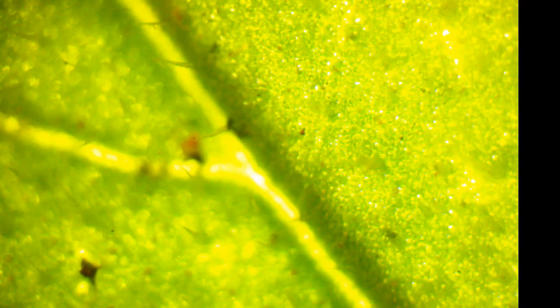And you can see the trichomes right away. And I can actually see trichomes on these with the naked eye. They look like little fine hairs. Yeah, it does look 3D. That's because the leaf won't really sit flat under the slide. And so as I zoom in and out, you're actually kind of looking at a 3D image and a 2D image, if you follow my perspective.